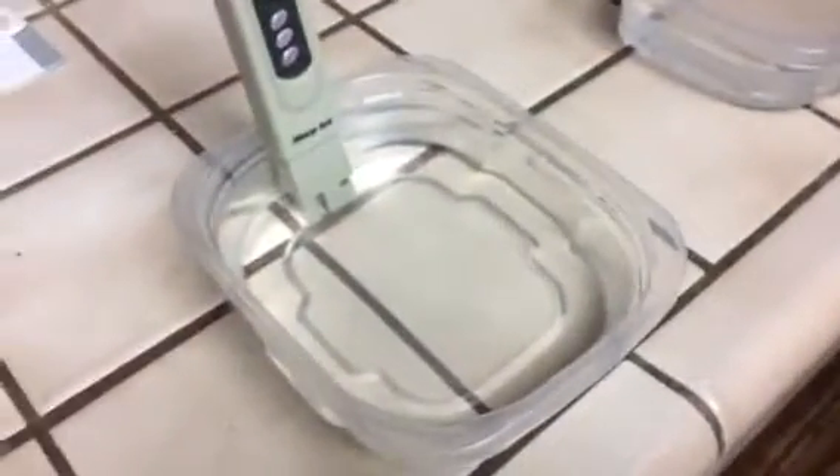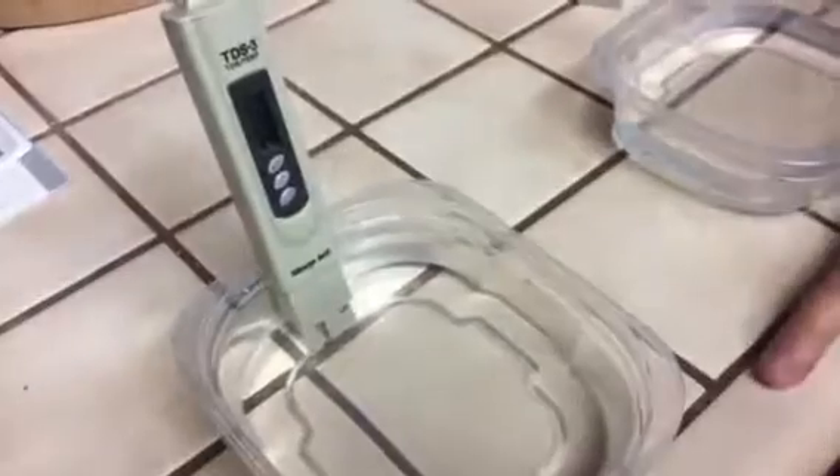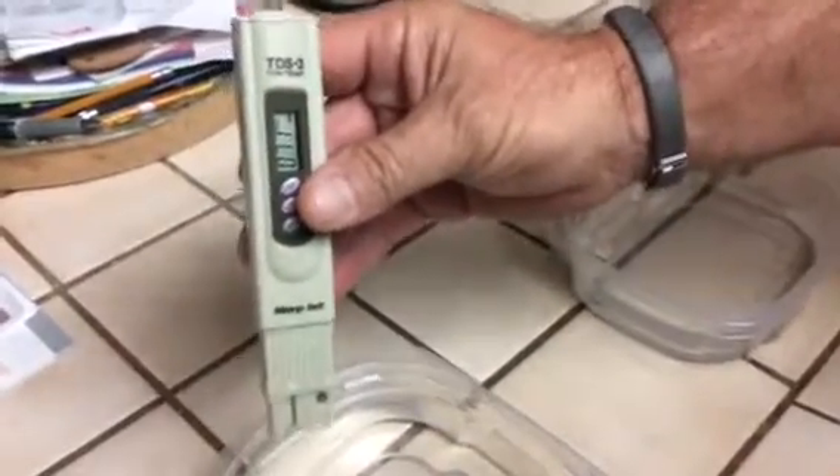And this one is our spring water. This is the water we have brought to the house in the pump. How long do you have to leave it in there? Just until it stabilizes. And this is saying 71, which is spring water.